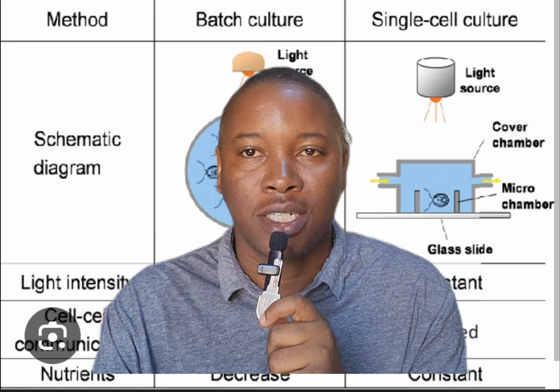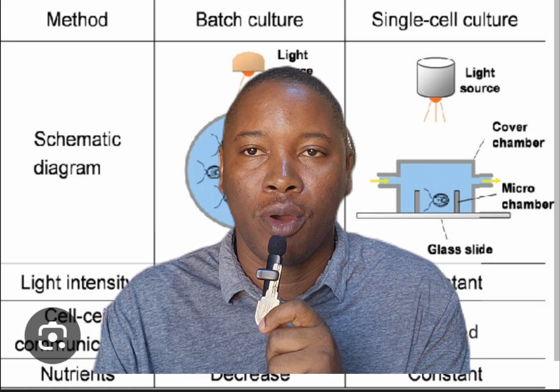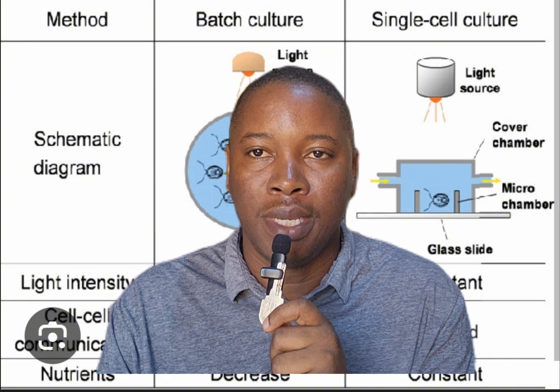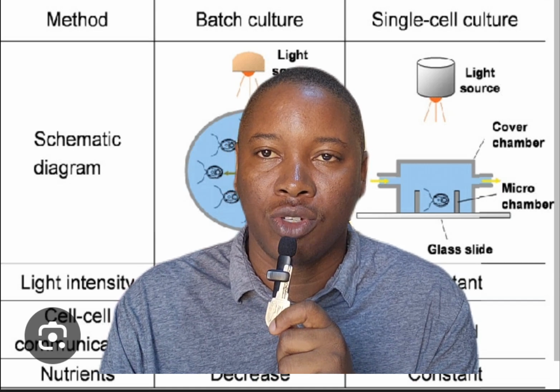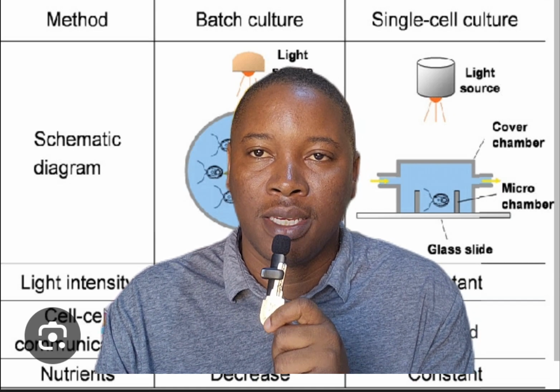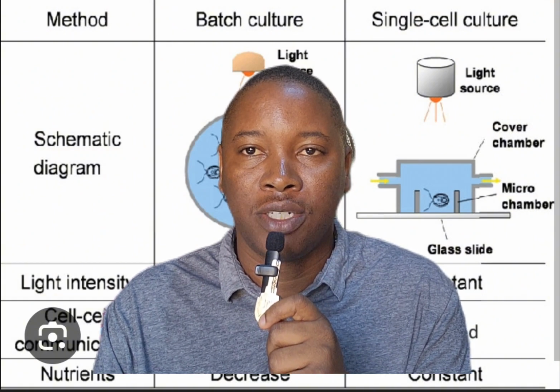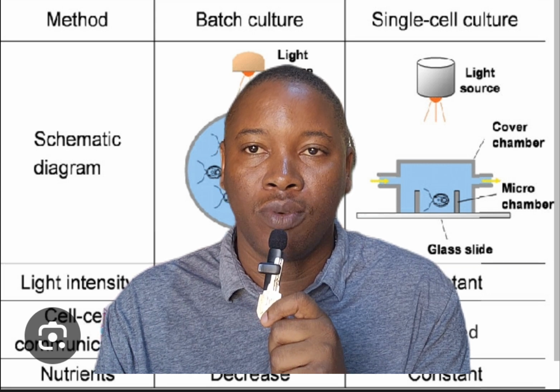Today we are discussing batch culture. What's a batch culture? This is the most common way by which we prepare culture media and then grow microorganisms in the lab. A batch culture is a closed system, where we're able to grow microorganisms within either a petri dish or liquid broth.